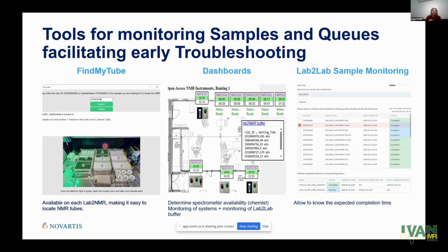And it's the same in my case, because sometimes chemists will measure in open access, then they are not able to interpret it and need help for the interpretation. I see he measured only a proton and HSQC.